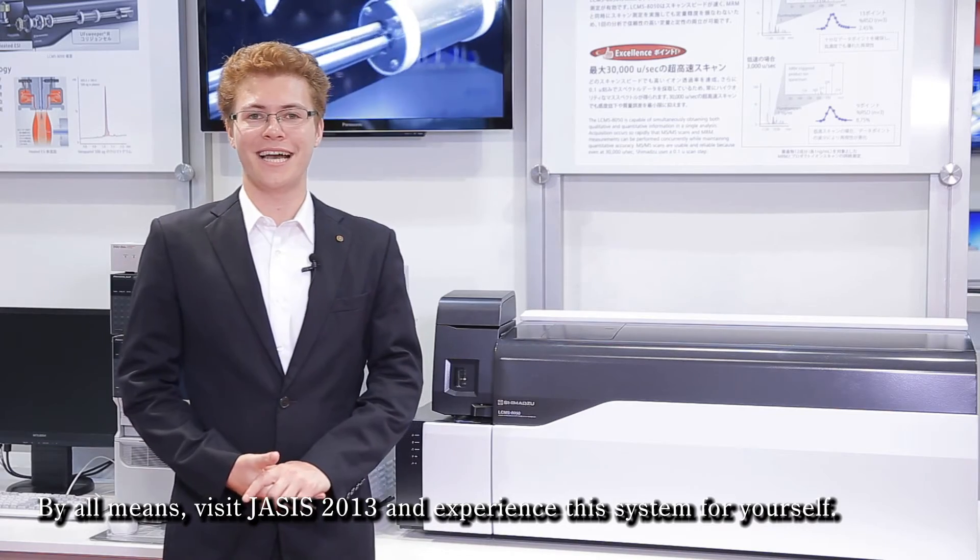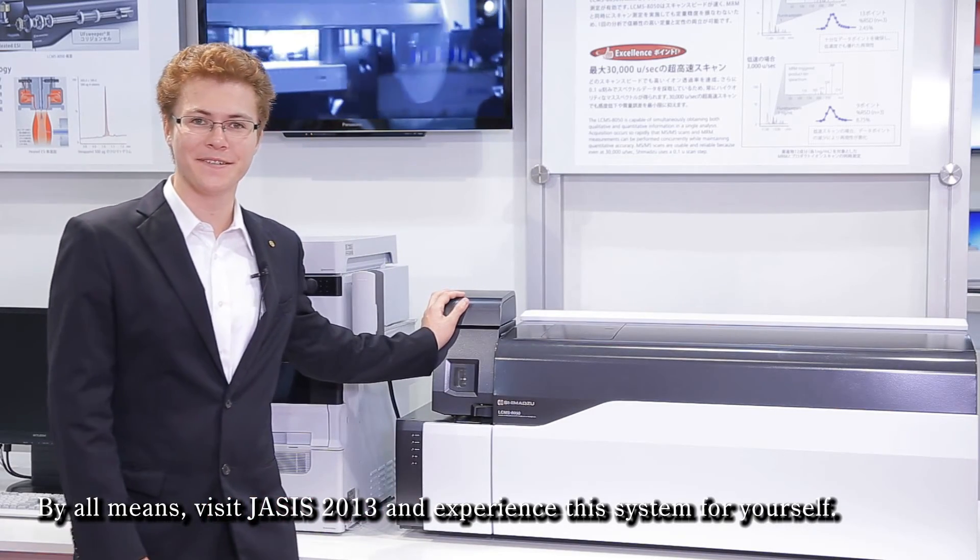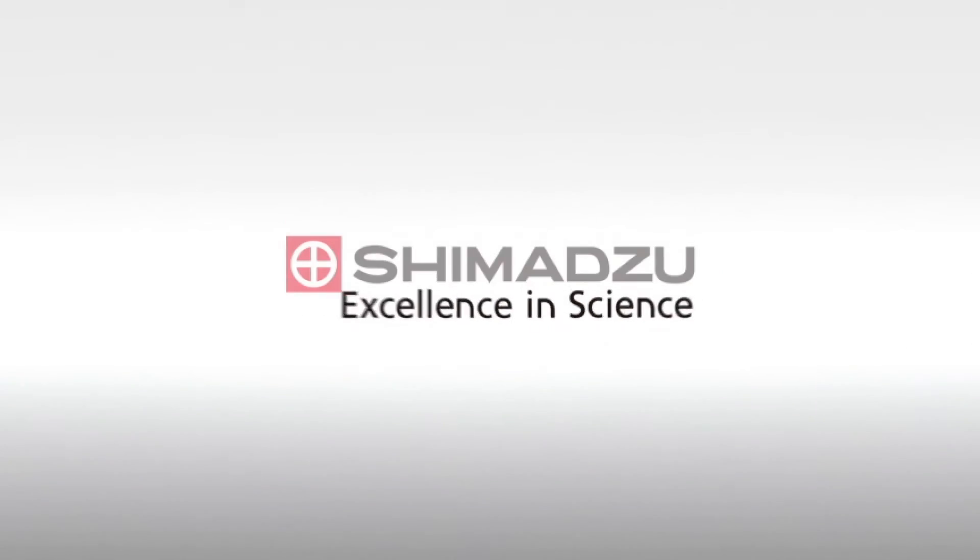By all means, visit JASIS 2013 and experience this system for yourself. Excellence in Science — Shimadzu. Thank you.